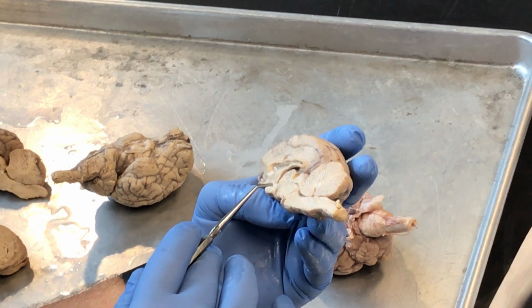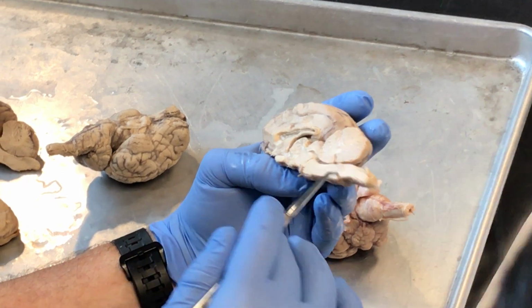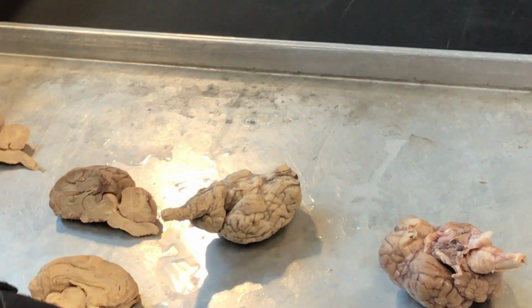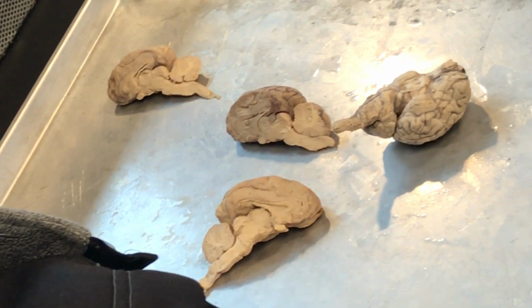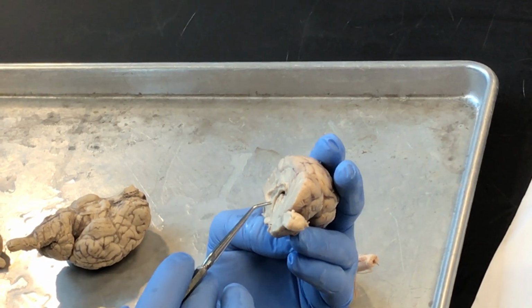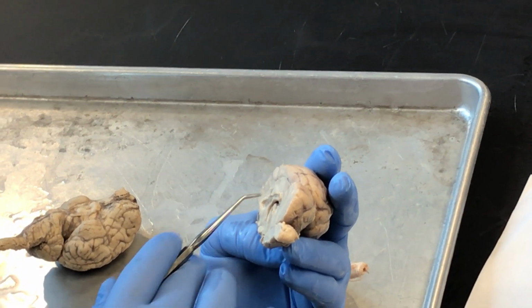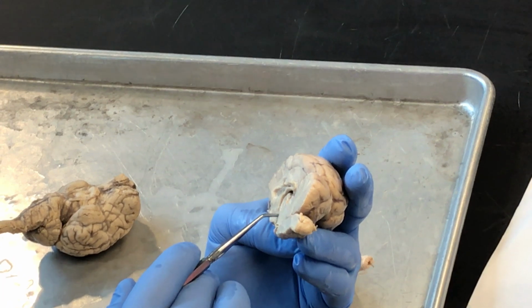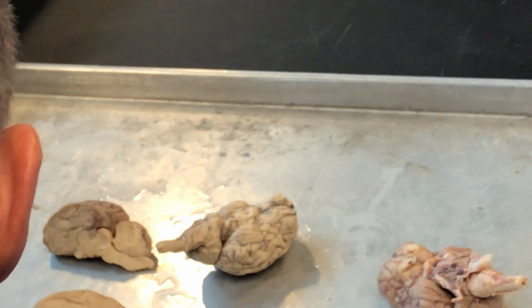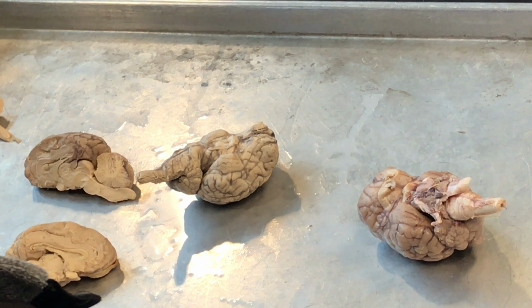It's carrying CSF, cerebrospinal fluid, from the third ventricle through this aqueduct back to the fourth ventricle. So where's the fourth ventricle? The fourth ventricle is at the base of the arbor vitae. See that space right there, that crevice? That's the fourth ventricle. Bottom of the arbor vitae right there is the fourth ventricle. So we go from lateral ventricle down to third ventricle, aqueduct of Sylvius to the fourth ventricle.